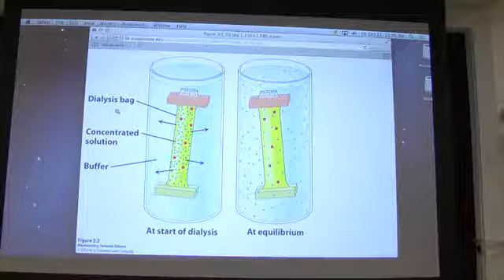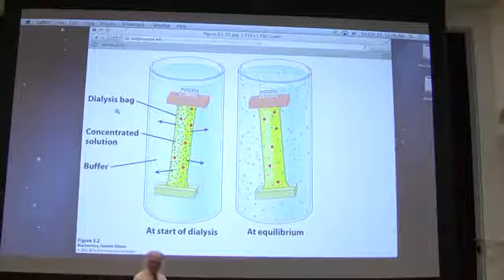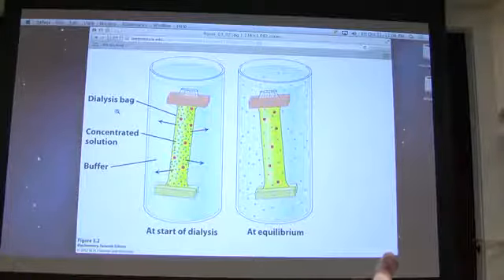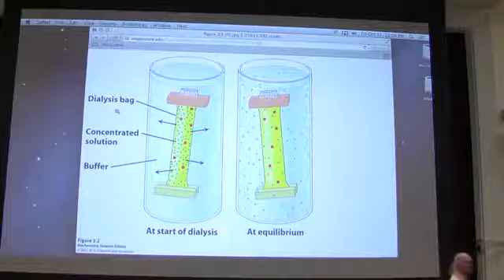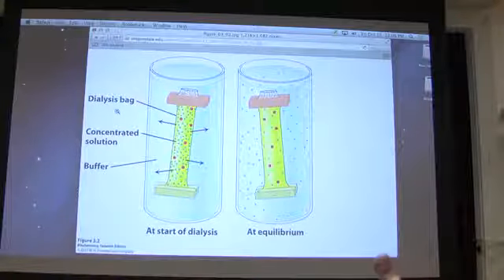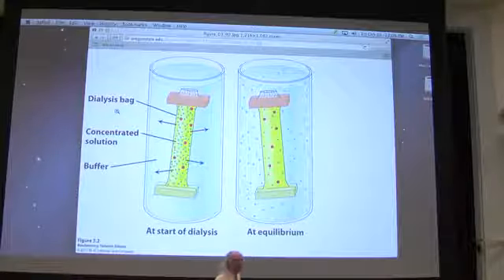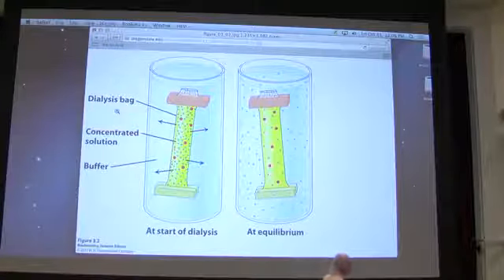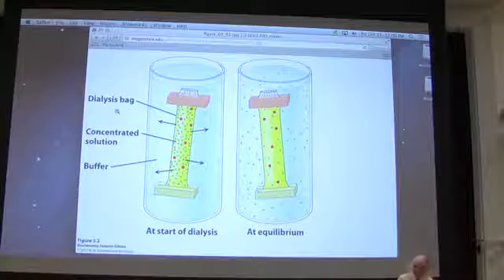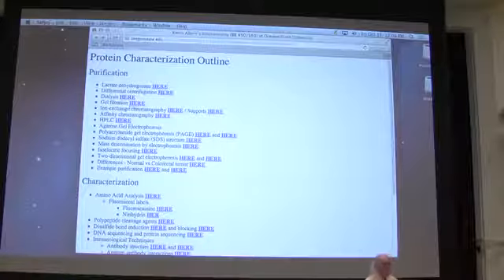So, for example, I might have a soup here that is full of salt, sodium chloride, or potassium chloride, or something like that, small molecules, and I want to get that protein and the other things that I have in here separate from those small molecules. Well, with dialysis, it's very simple. The small molecules, as I said, are permeable. They'll come out. The larger molecules are not permeable, and they will remain on the inside. Okay? And in doing this, I'm thus able to remove most of the salt away from the proteins or the other things that I'm interested in here. So dialysis turns out to be a very simple yet useful way of separating big from small.